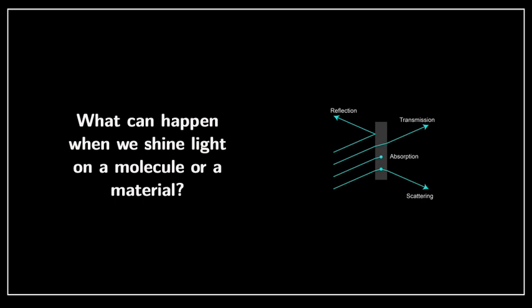You can have absorption of light, and this absorption can then be used, for example, for PL measurement, so photoluminescence measurement. We are not interested in that one. But we also have scattering. Scattering is this interaction between the light and the material, where the light basically gets in, interacts, and then gets out.